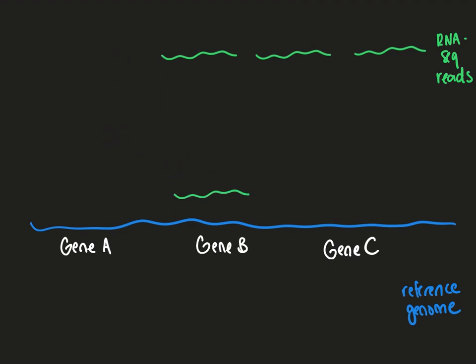I mean find where they align. So you take this sequence, or your program takes this sequence, and it says, does it fit here? Does it fit here? Does it fit here? Because remember, I have just drawn these as squiggly lines, but on that squiggly line, you should imagine A's and T's and G's and C's of a sequence. So where does that sequence match?